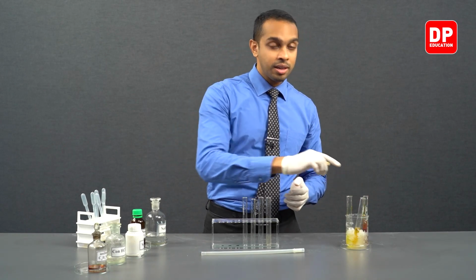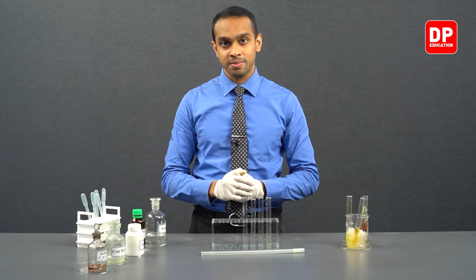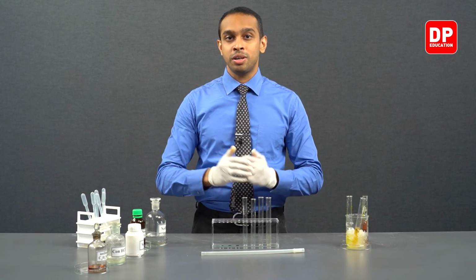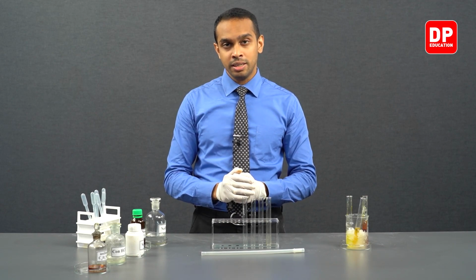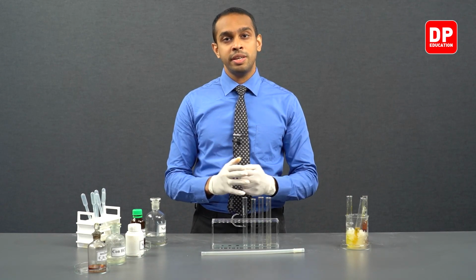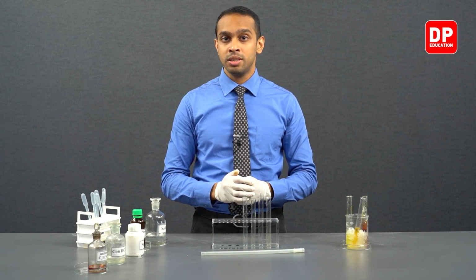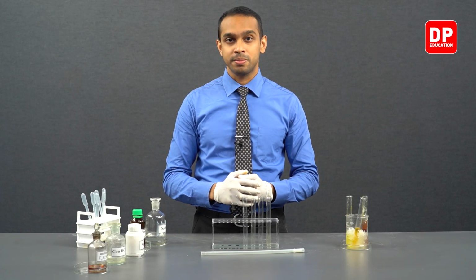In summary, let's take a look at what reaction we looked at today. Initially, the first part of this practical, we took aniline and we dissolved it in water. And upon addition of water, we realized aniline forms two layers with water, indicating that it is not soluble in water.